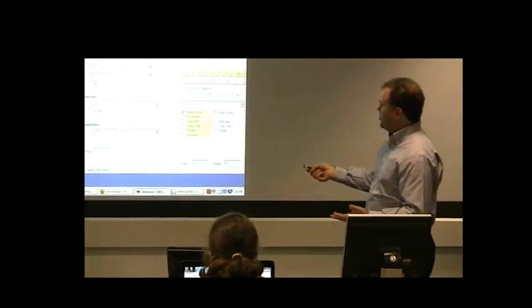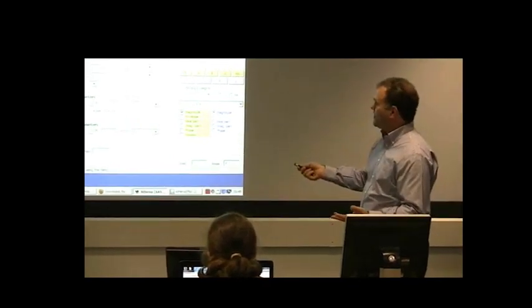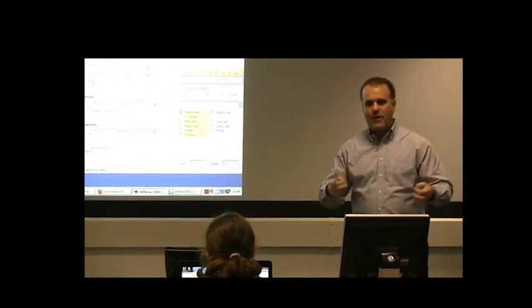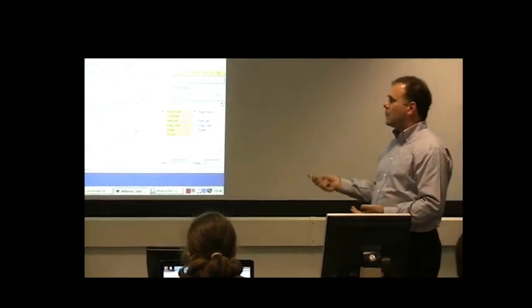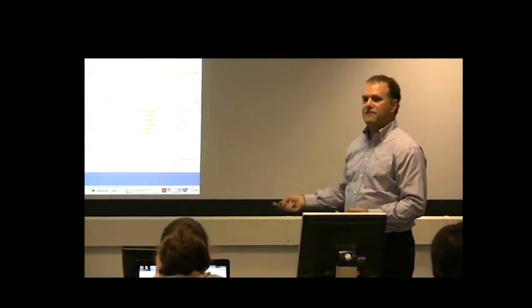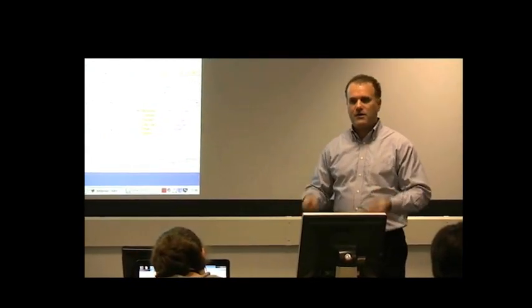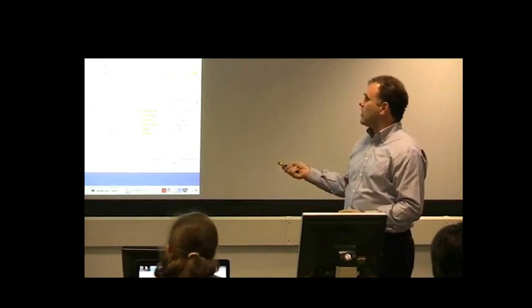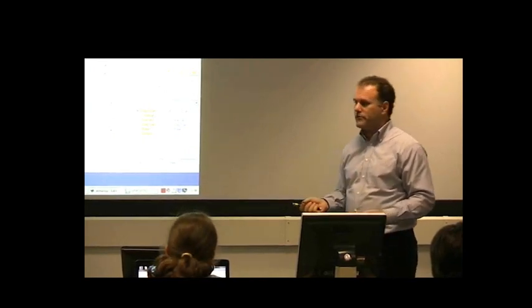Yes, you can change this number and a few other things also, but at the end of the day, a good background is one that is not highly correlated with the parameters of the fit to the first shell. That criterion always holds. If changing this number helps you process your data, then by all means do so.